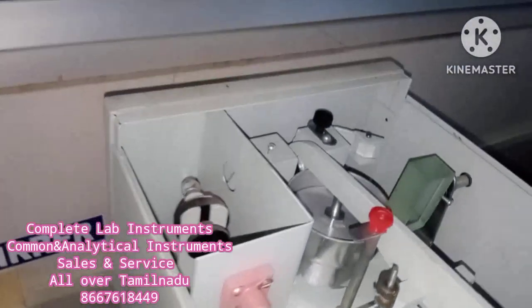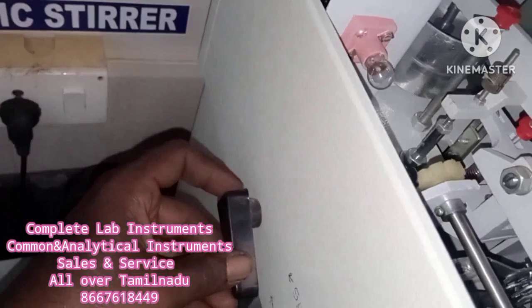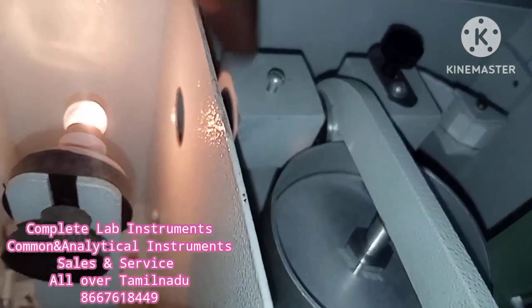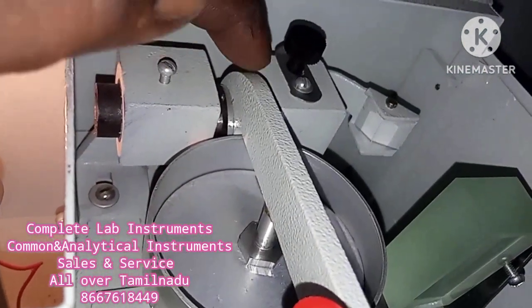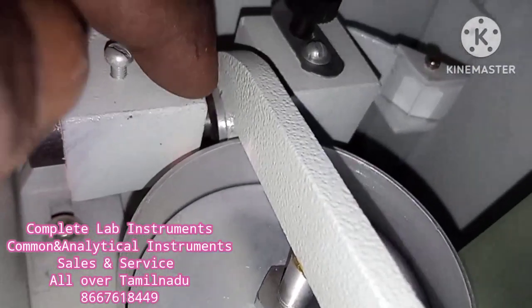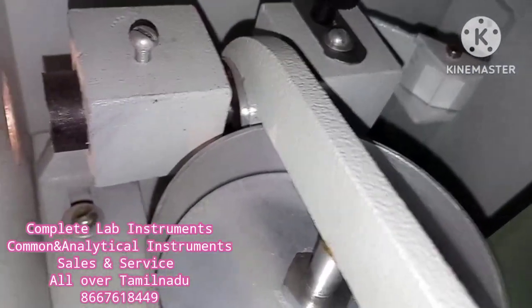If you look at this instrument, this is on position and this is a bulb. This bulb is light and there is a lens. This is a light source of sharpness. This is a long stem, this is a white color ring. This is a scaling.